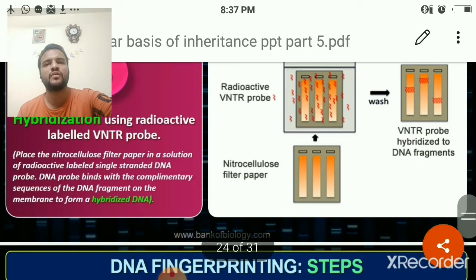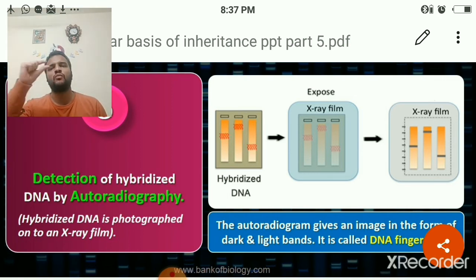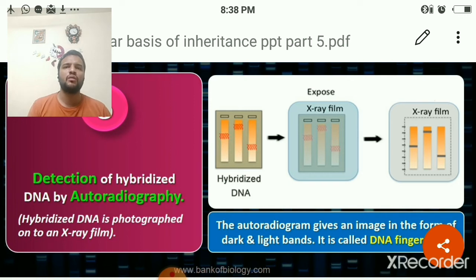Next, what will happen? Now, whatever hybridized DNA are there can be detected by autoradiography. Means the hybridized DNA are photographed on X-ray film sheets, and on the X-ray film sheets these hybridized DNA, or the VNTR hybridized probes, are observed as dark bands. These dark bands will give a particular pattern for a particular sample of the DNA. So this is detected with the help of autoradiography, that is nothing but the X-ray film.